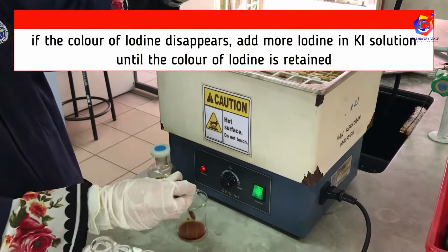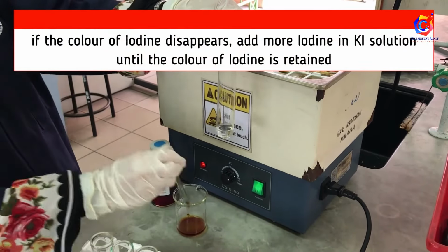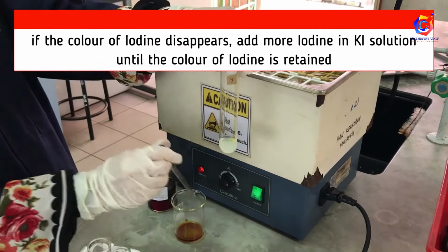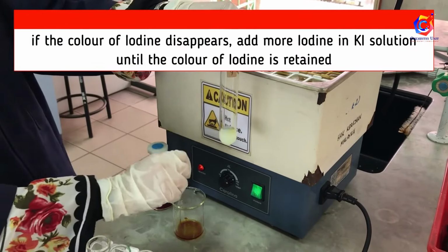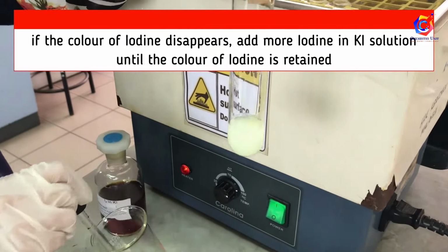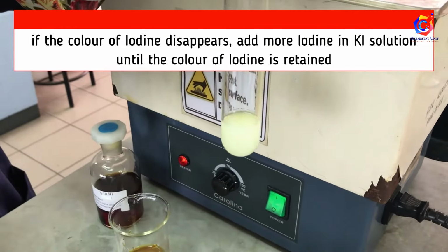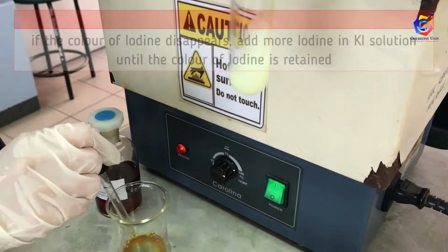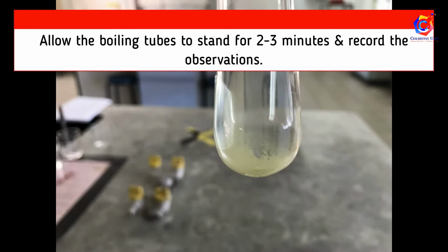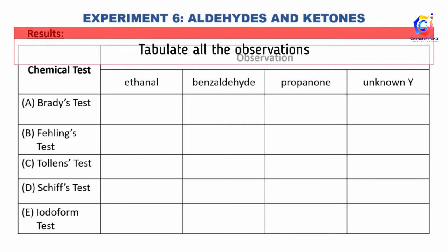If the color of iodine disappears, add more iodine in potassium iodide solution until the color of iodine is retained. Allow the boiling tubes to stand for around 2 to 3 minutes and record the observations. Tabulate all the observations and you're done.